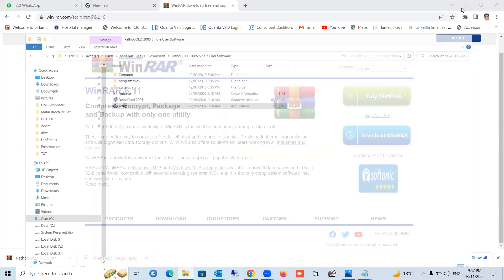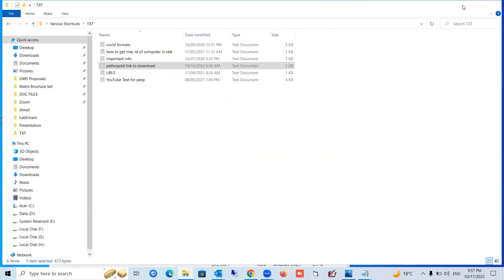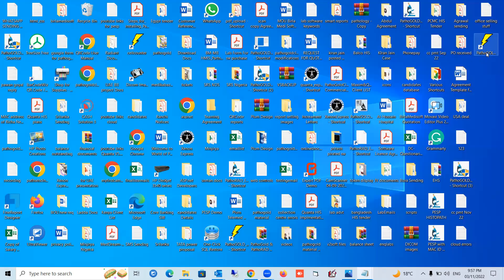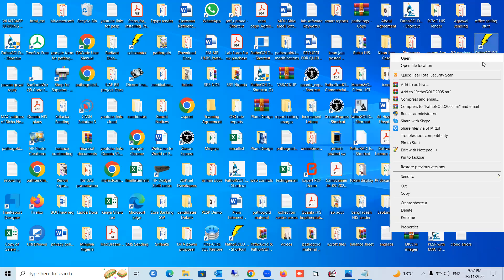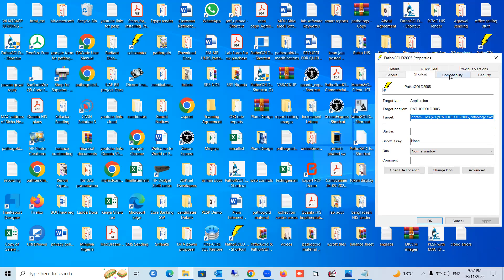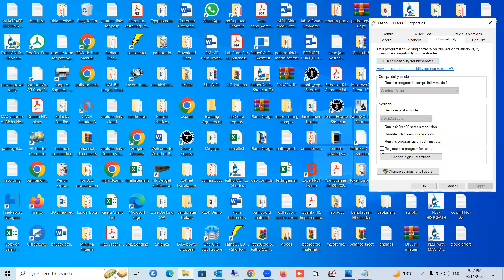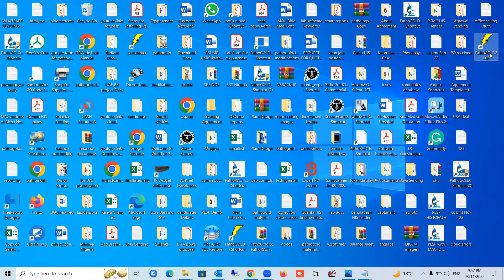On the desktop you will get a yellow color icon — this is the Pathogold icon. Right-click on this icon and go to Properties. In Properties, go to the Compatibility tab. Under compatibility settings, tick 'Run this program as administrator' and press the Apply button, then press OK. Now you are all set.